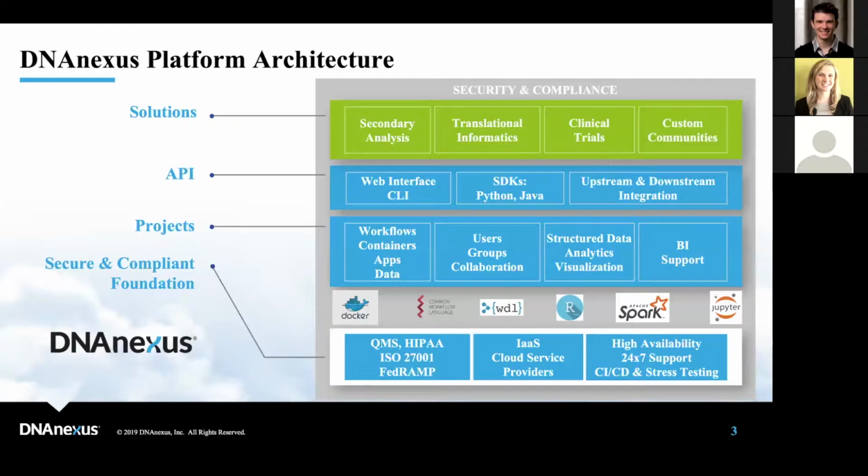So a secure and compliant foundation forms the basis of the DNAnexus platform, within which you can run your NGS analysis in the cloud. On the second layer, you can see we provide support to the most commonly used frameworks in the bioinformatics and genomics community. So if you're using Docker to maintain your dependencies, you can use the DNAnexus toolkit to manage the same dependencies within the DNAnexus platform.